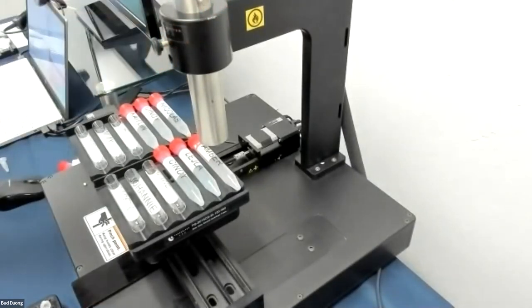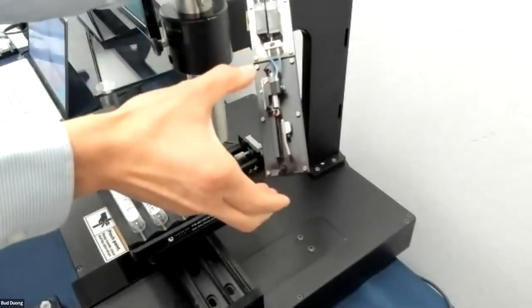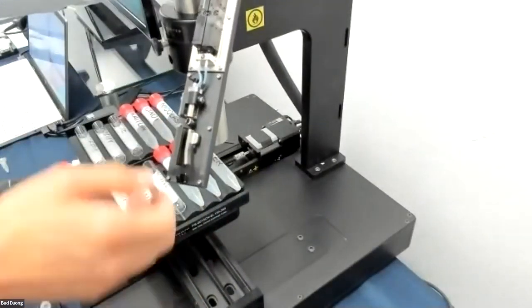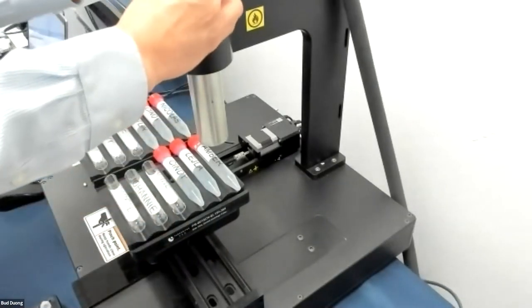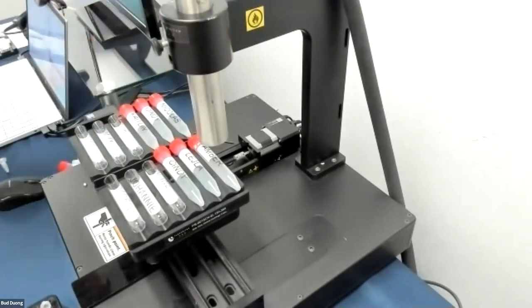The third part of maintenance is cleaning the printhead. You simply remove it from its sleeve. Over time there could be some ink buildup, so you rinse it using a squirt bottle, catch the runoff in a beaker, and rinse for about 30 seconds to a minute, then let it air dry for a minute. You're using a solvent similar to acetone, so you'd dispose of it the same way — probably in your solvent waste. So the three parts of maintenance are: changing the cartridges, running it every one to two weeks if you're not using it, and doing that printhead cleaning every one to two weeks as needed.